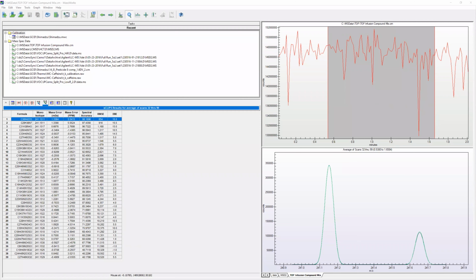You want to take that one, Yongdong? Okay, well, I would alter that. It's a question from Professor Dan Kirshner. I assume everybody can see the question, right? So I don't have to repeat it. Yeah, you have to repeat it, I think.